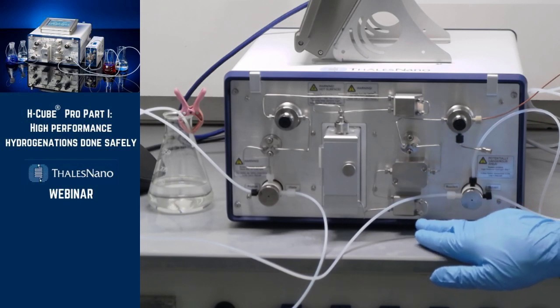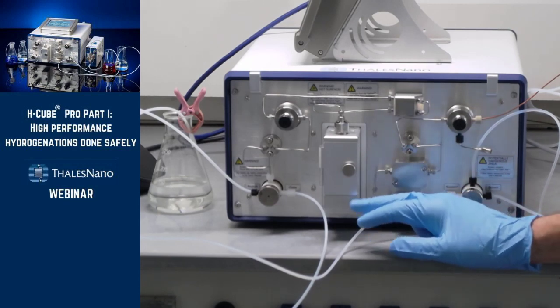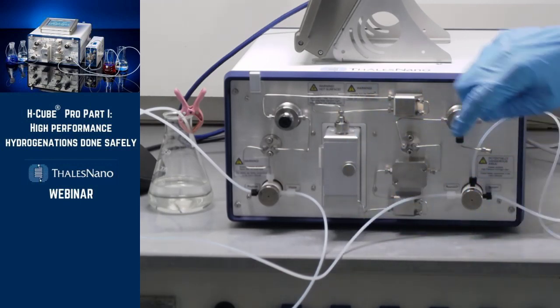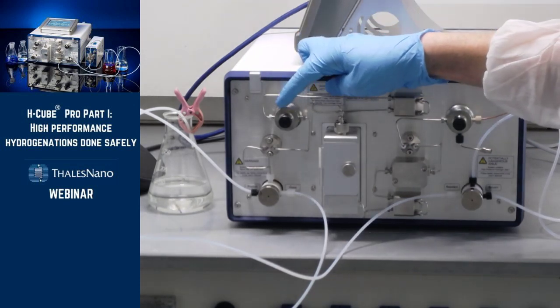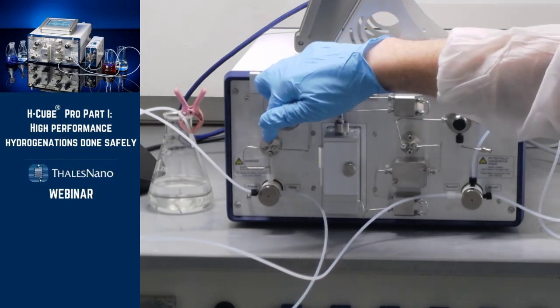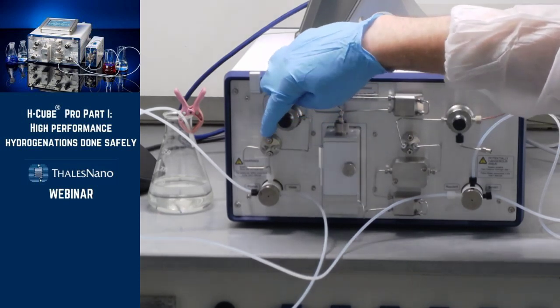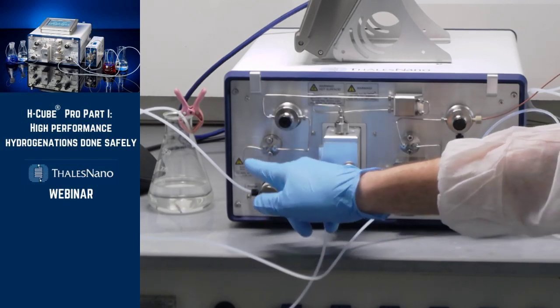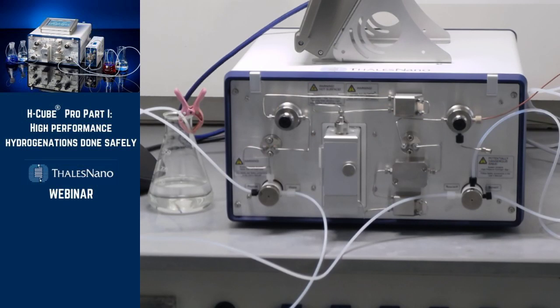From this connection point, the liquid gas mixture goes through the CatCart heater. I will show you the cartridge later on. And then we again go into a pressure sensor, but now we are at the back pressure sensor. From the back pressure sensor, we arrive at the back pressure valve. And after that, again, we have a switch valve. At this point, the solution is already at normal pressure or just at a pressure which is generated by the flow rate. And after that point, we just have a flask where we collect our material.